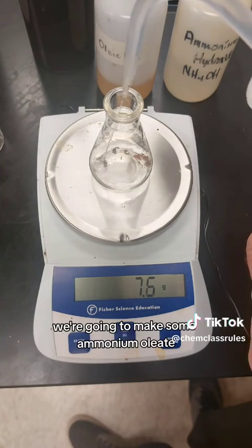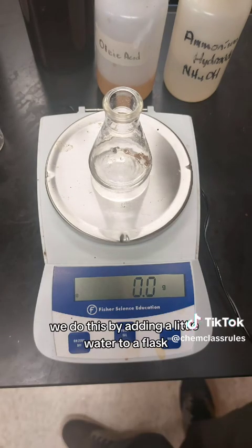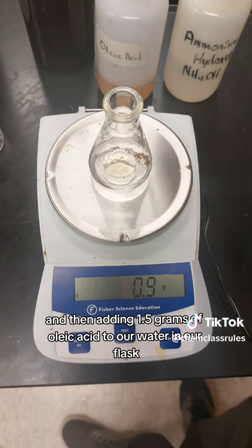While that's mixing, we're going to make some ammonium oleate, which is a soap particle that's going to coat our magnetic particles. We do this by adding a little water to a flask and then adding one and a half grams of oleic acid to our water in the flask.